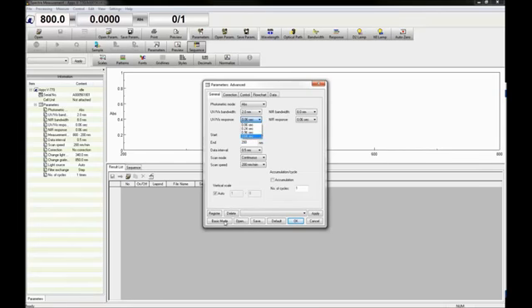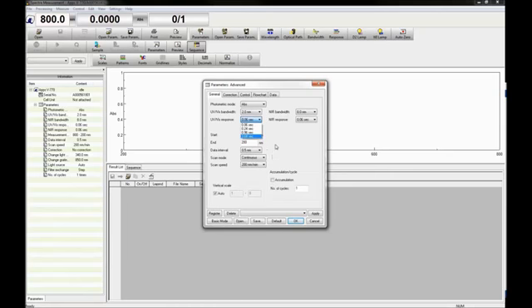If basic mode has been selected, the optimum UV-VIS response is automatically determined from the specified bandwidth and scan speed, and the NIR response is set to the same value as the UV-VIS response.